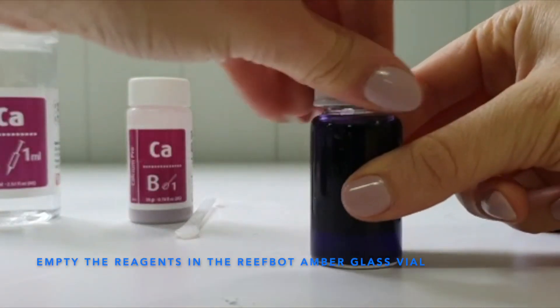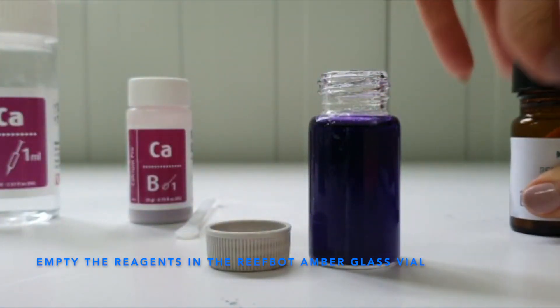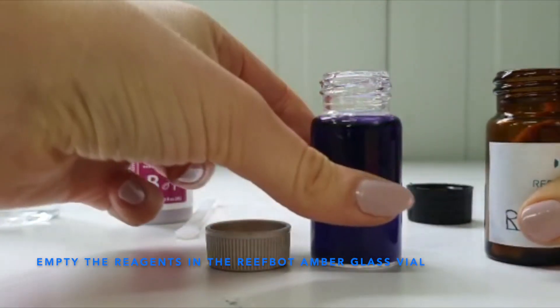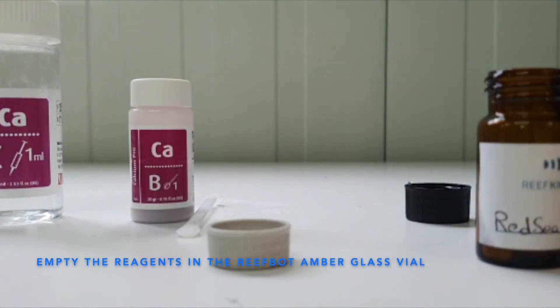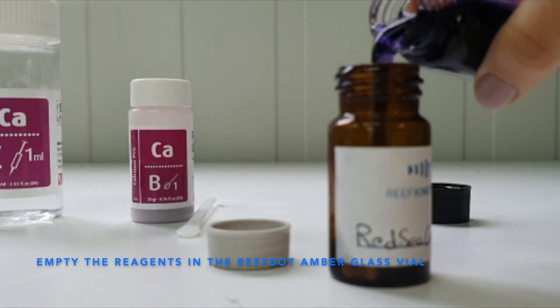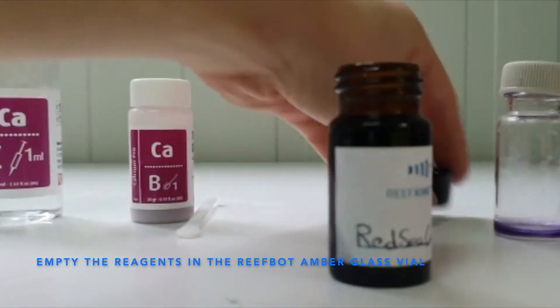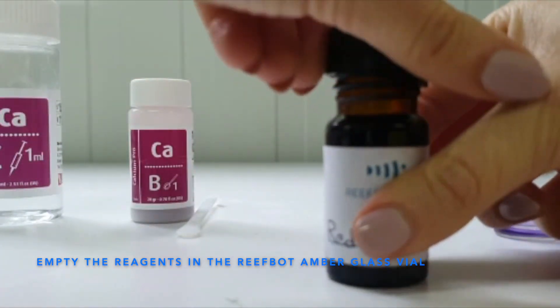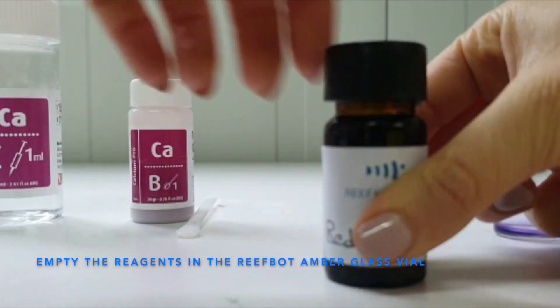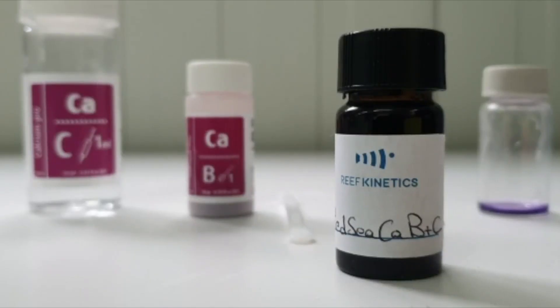Transfer to a clear solution into the amber vial. The shelf life of the prepared reagent is 2 weeks. After this period, you might face inaccurate results.